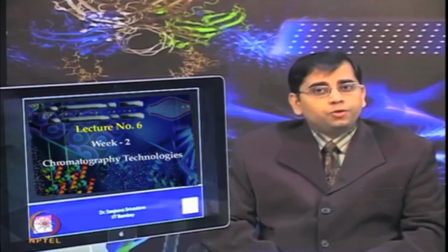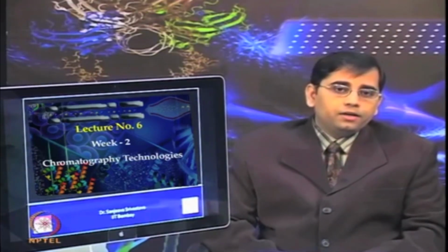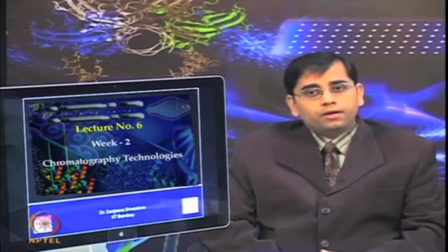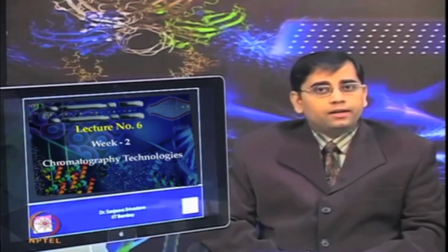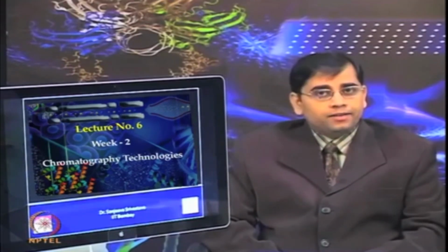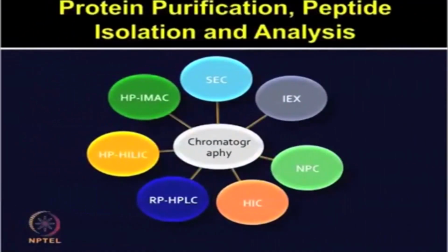From a complex proteome, it is challenging to purify a protein in a single chromatographic step. Therefore, sequential pre-fractionation steps involving different modes and types of chromatography methods are becoming necessary for proteome level analysis. Protein purification, peptide isolation and analysis.